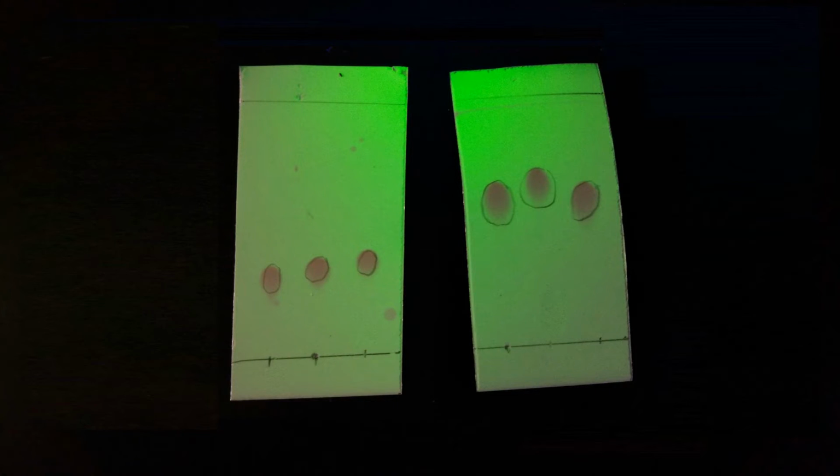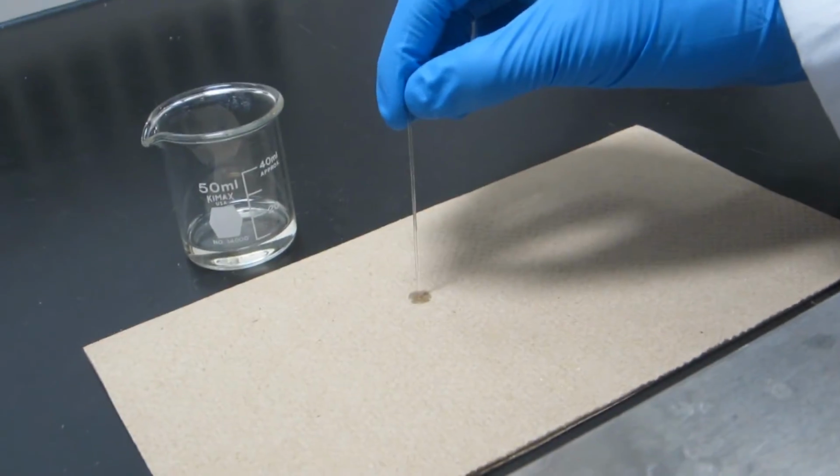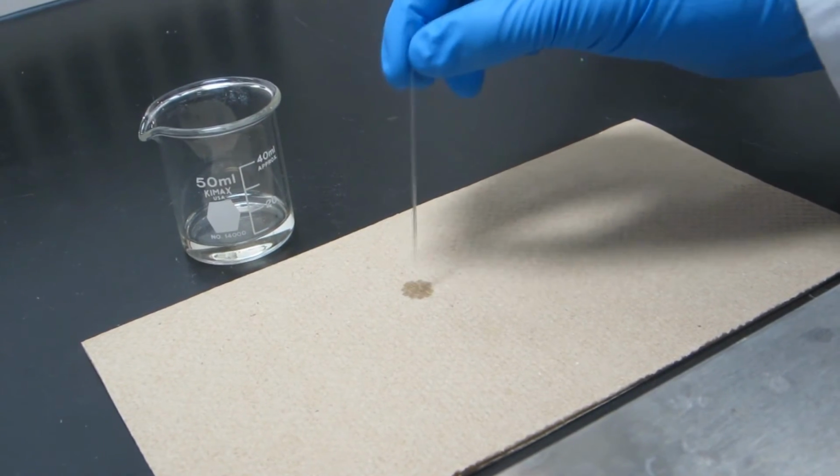on the plate. If your sample is UV active, you may confirm whether you have deposited enough sample onto the plate by holding it under a UV lamp. If you see a dark spot about 1 to 2 millimeters in diameter, you have enough sample. If the samples are too concentrated, they may bleed into each other and it will be difficult to tell the spots apart. Before you begin spotting another sample, be sure to clean the capillary spotter to prevent contamination.